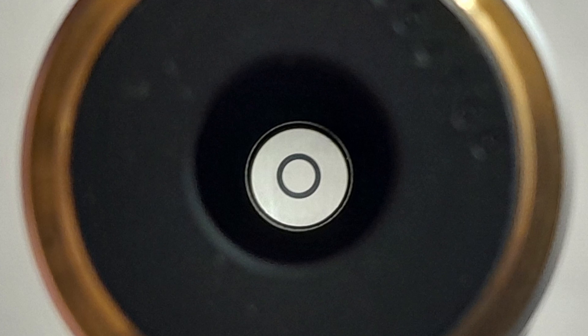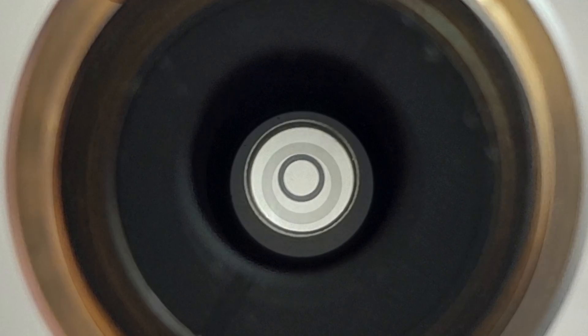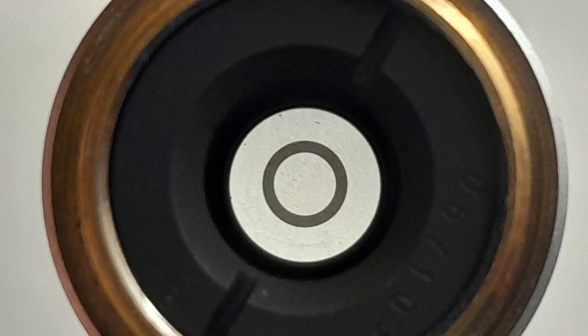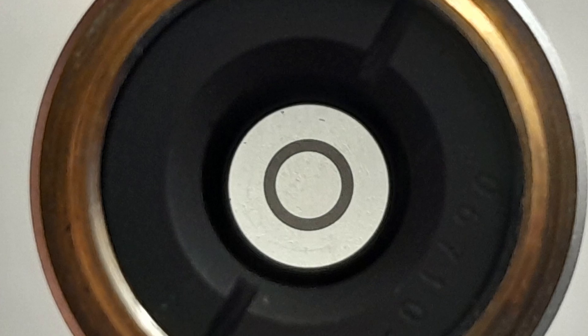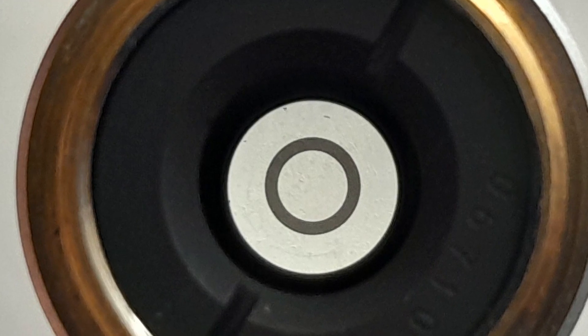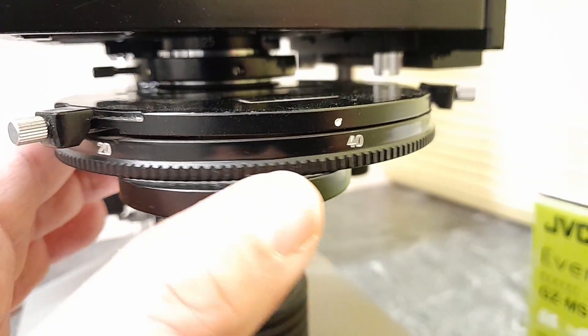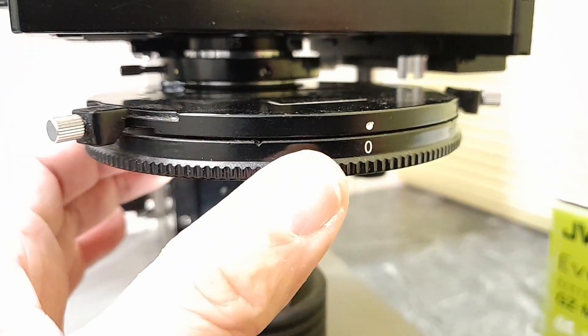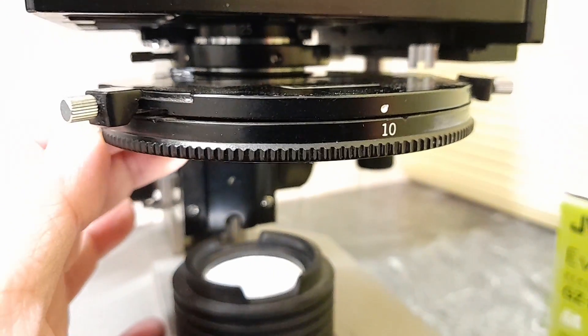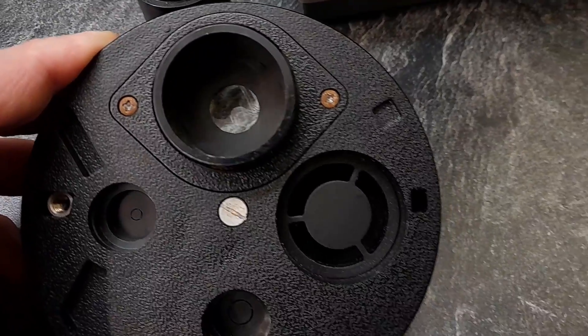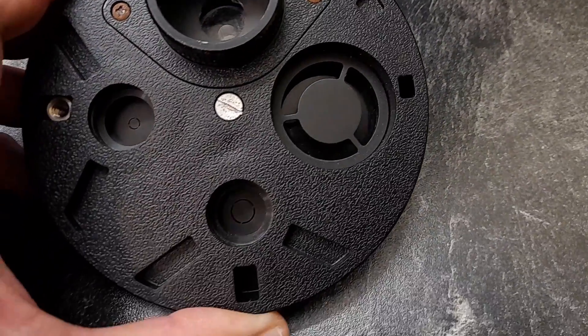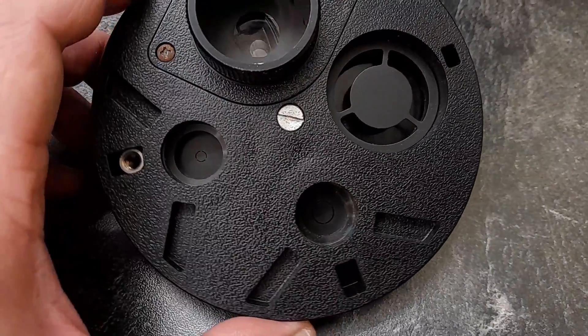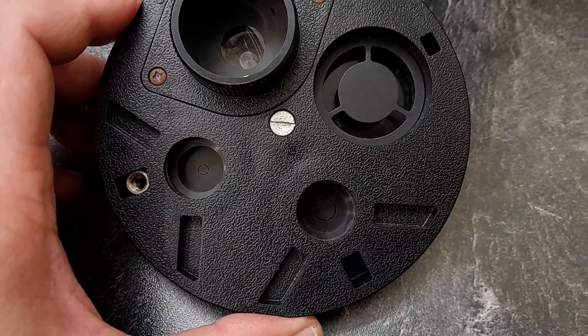And here, this is a phase ring. So when you take out a phase contrast objective and look at it from behind, then you're able to see this phase ring, which is semi-transparent. You also need a phase contrast condenser. And in this case, it's a rotating condenser, which allows you to use phase contrast besides bright field and also dark field. So it's a multipurpose condenser. The two phase annuli are for 10 times and for 40 times.